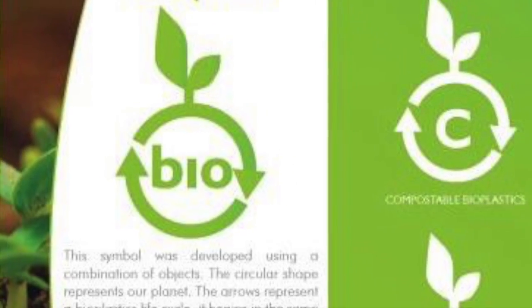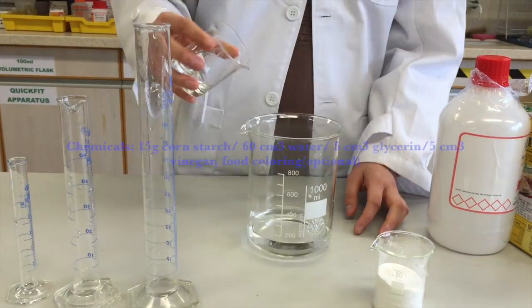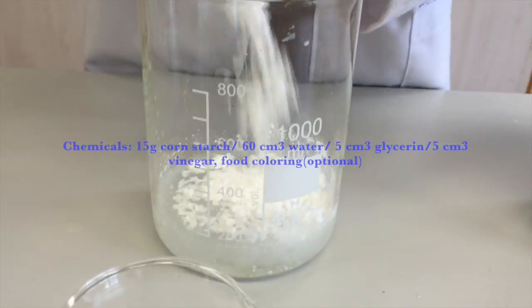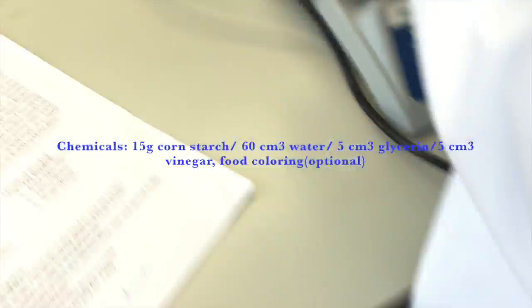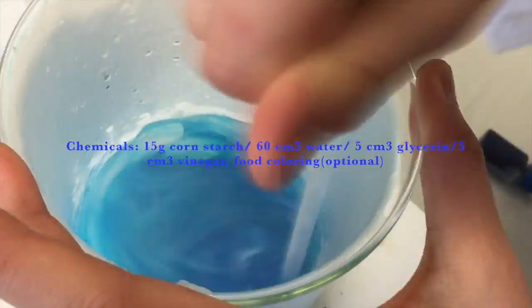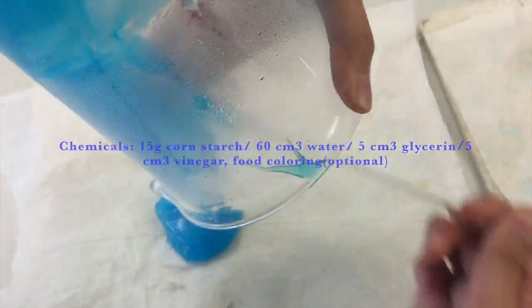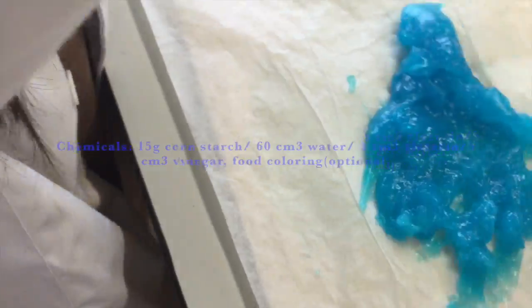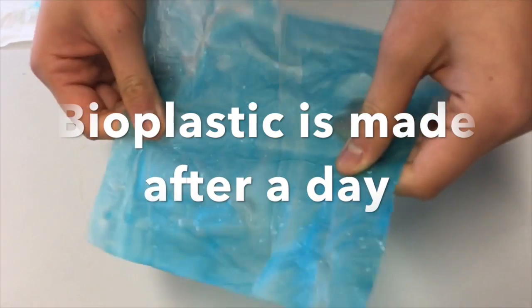Here is how to make bioplastic. Making bioplastic is simple. Put all the chemicals in a beaker and heat it up until it turns to a jelly-like and transparent mixture. Then pour it onto a non-stick cooking paper and let it dry for a whole day in a fume hood. And bioplastic is formed.